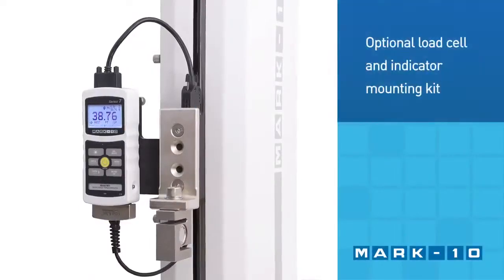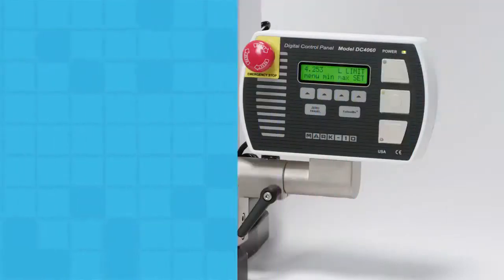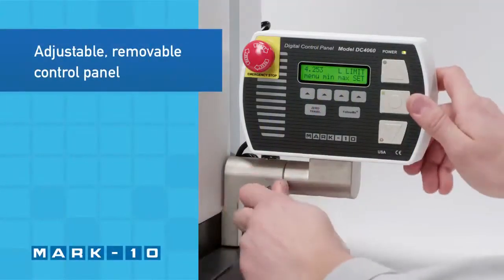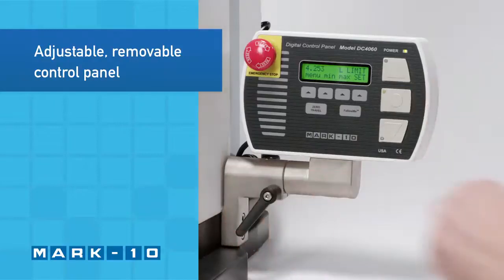An optional load cell and indicator mounting kit is available. Adjust the viewing angle of the control panel or remove it from the column for ergonomics or safety considerations.